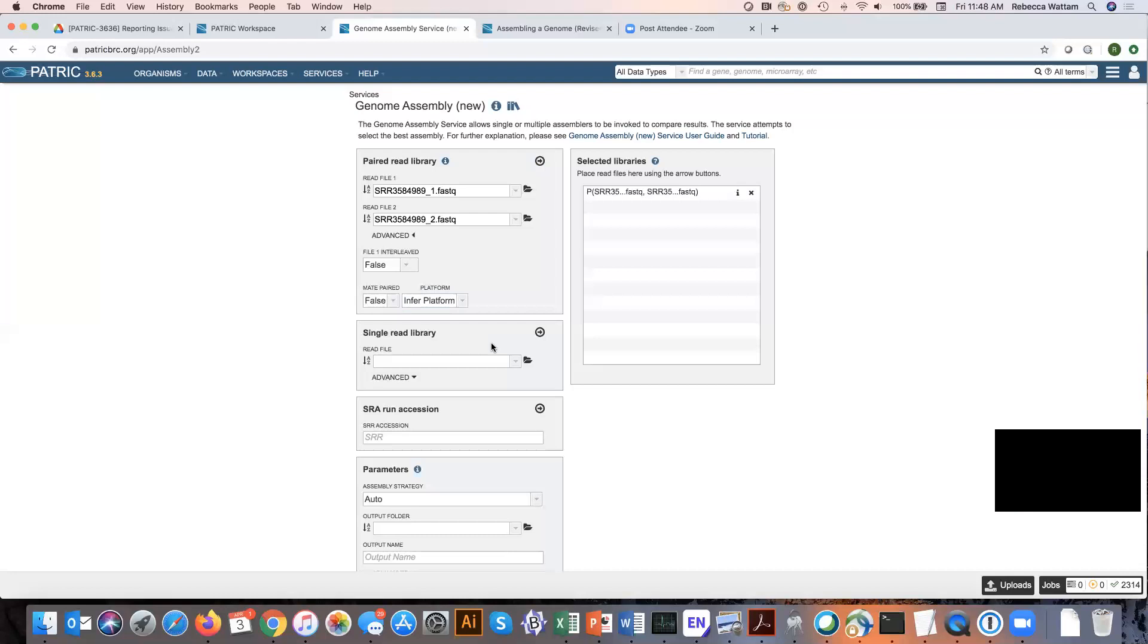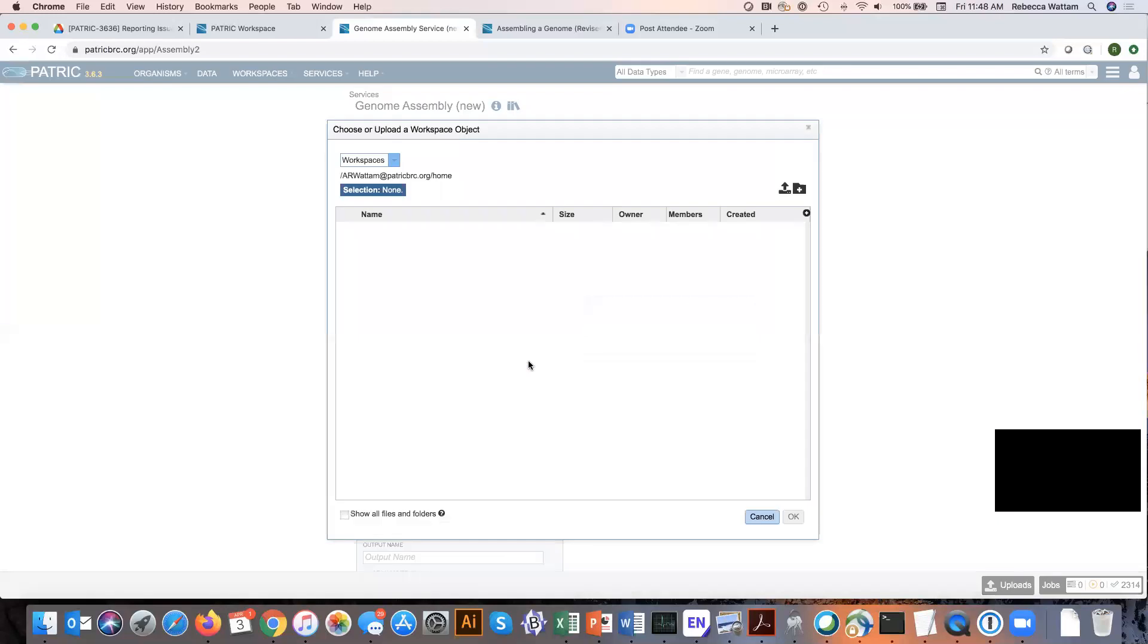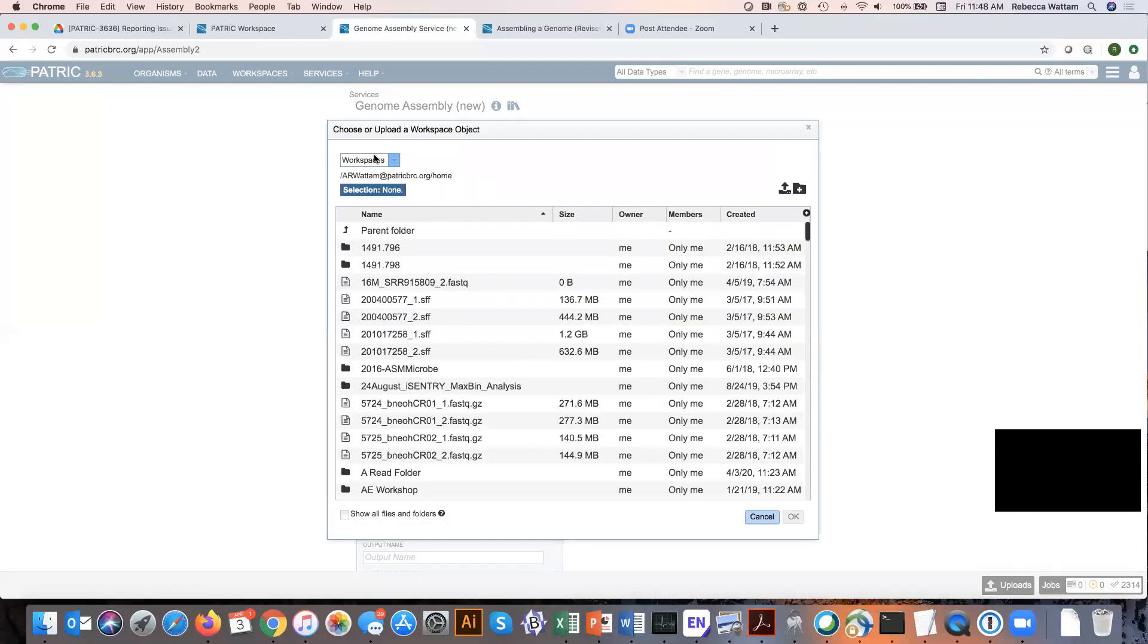Another thing you can do if you have PacBio and Illumina, people often do this to get a better assembly with deeper coverage. You can combine those by having your Illumina reads come in through the paired read, and your PacBio reads come in through the single read. You'd do the same thing to load that by clicking on the file and uploading it through the workspace.